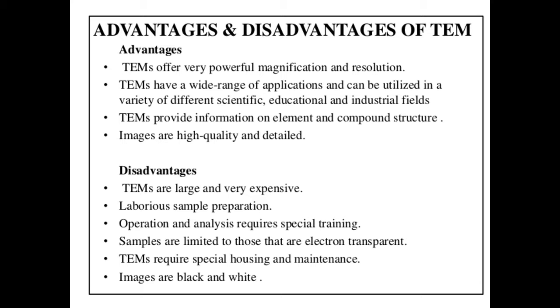Then, there are some more advantages as well as disadvantages for TEM. First, we see about the advantages. TEMs offer very powerful magnification and resolution. TEMs have a wide range of applications and can be utilized in a variety of scientific, educational, and industrial fields. It provides information on element and compound structure. Then the images are high quality and detailed.